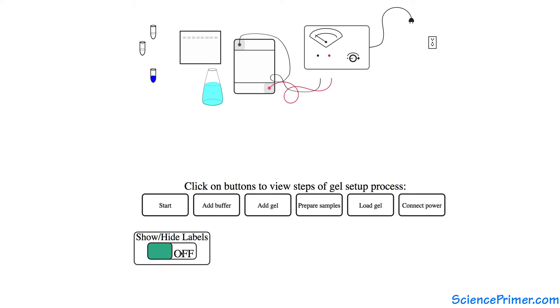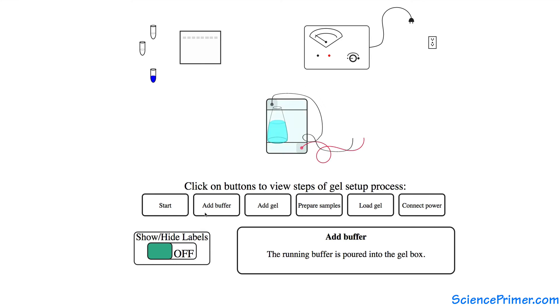With all of this material in hand, the steps required for setting up a gel are: prepare the gel box by adding enough running buffer so that the gel will be completely submerged once it is placed in the gel box. The buffer does not have to be replaced every time a new gel is run, but the electrophoresis process does degrade the buffer, so it's a good practice to replace it frequently.